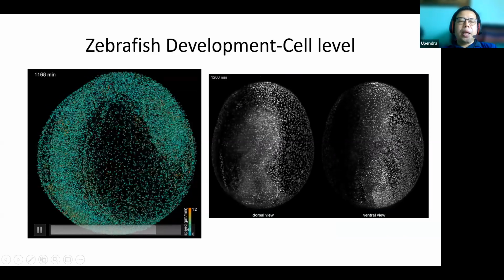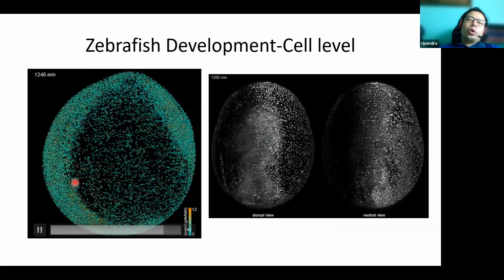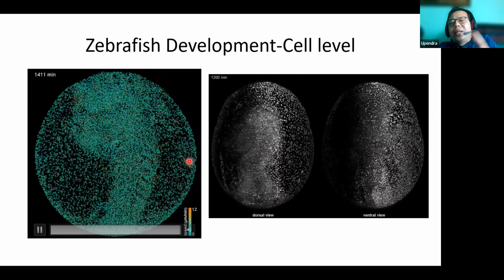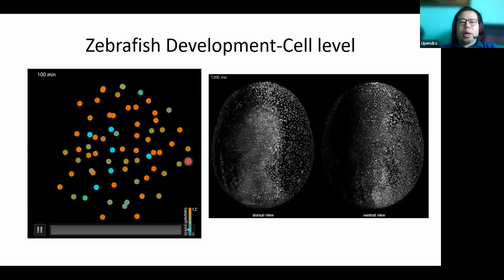So the brain will be here and the muscles will be here from these cells, right? So they were able to show it in the early embryo, but exactly what happens in the later stages is challenging, because we need to follow for at least 72 hours with the specific organ in mind, and we have to do it, right?